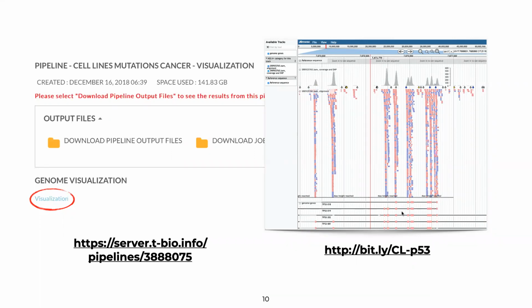Introns are not expressed, so they're not transcribed into mRNA, they're spliced out typically. And so when we do whole exome sequencing, we do not sequence those regions. So as you look down here, these are exons, and you can see that the coverage of reads is only within exons.